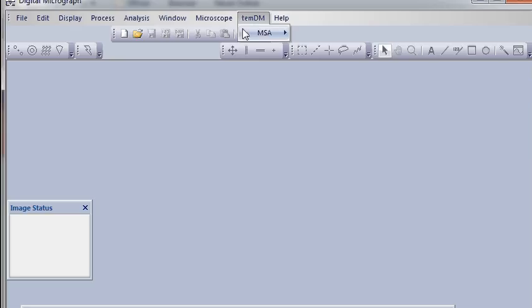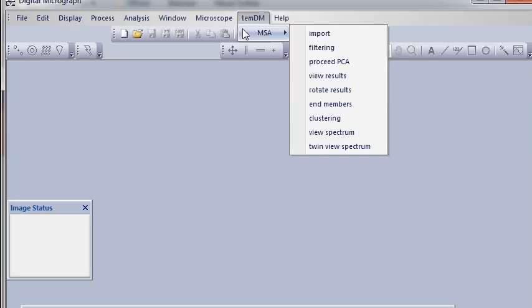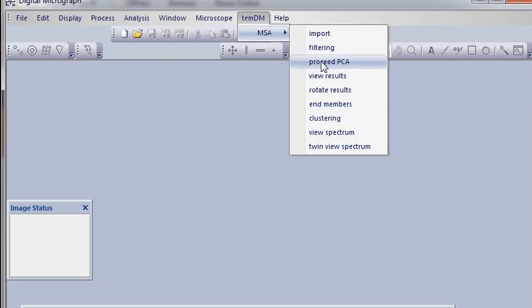It consists of a lot of sub-menu items like import, filtering, processing, and so on. Each such item is connected to a certain tool which is doing definite processing operations with your spectrum image.